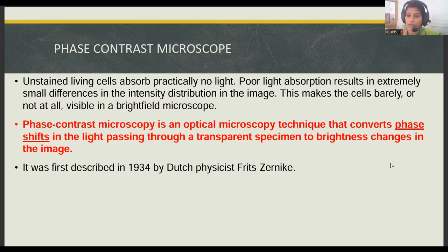Here, we are going to use light as the source, which will enable us to study the organism effectively without staining it. As in, live organisms can be studied, the live condition of the specimen can be studied.